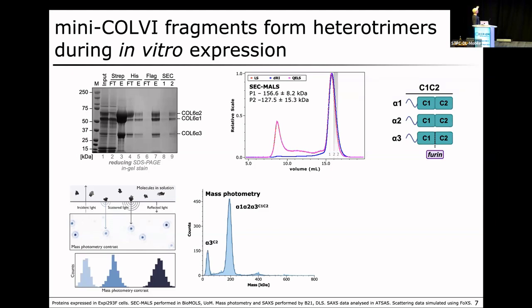And the idea is whenever a molecule in your sample touches down on the glass, it will scatter the light, and the scattering of this light correlates to the size of your particle, and the size of your particle correlates to its molecular weight. And then you can use a weight standard to convert this light scattering back into mass.